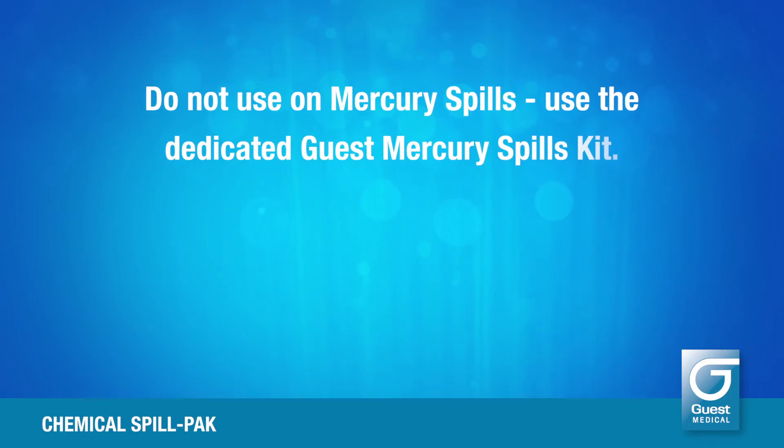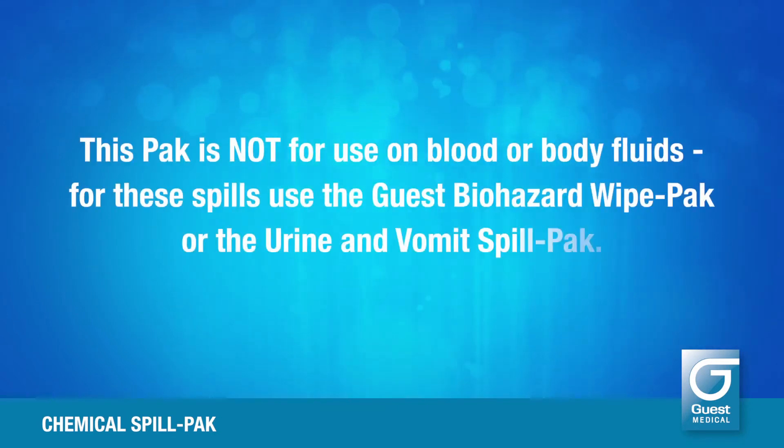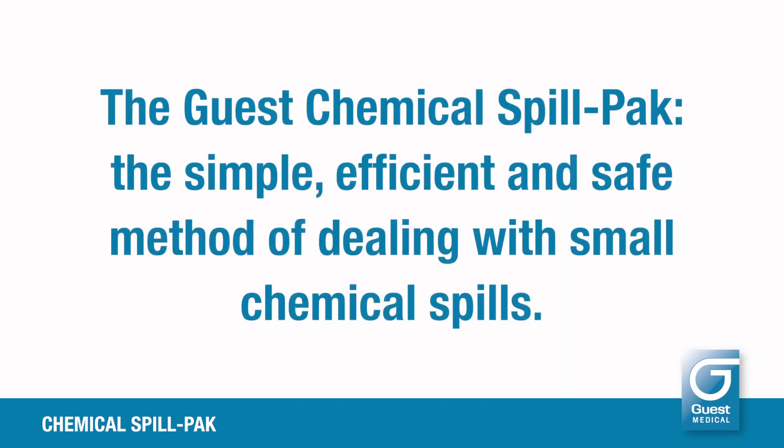Do not use on mercury spills — use the dedicated Guest mercury spills kit. This pack is not for use on blood or body fluids; for these spills use the Guest biohazard wipe pack or the urine and vomit spill pack. The Guest chemical spill pack: the simple, efficient, and safe method of dealing with small chemical spills.